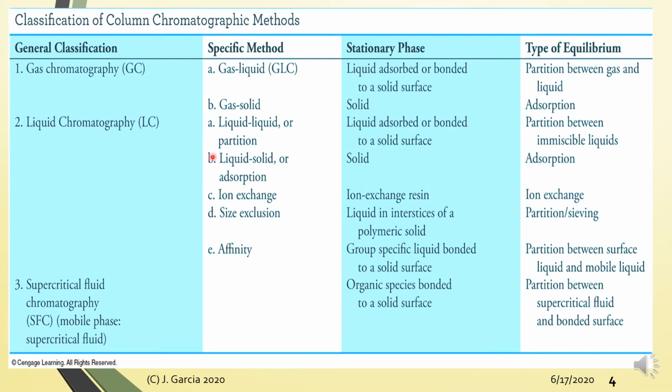Okay, yung partitioning, ano yan eh. Basically, physical process yan eh. Alright? So, if you want to separate a racemic mixture of an enantiomeric pair, then the only choice that you have is to use chiral chromatography, which is basically a type of affinity chromatography.